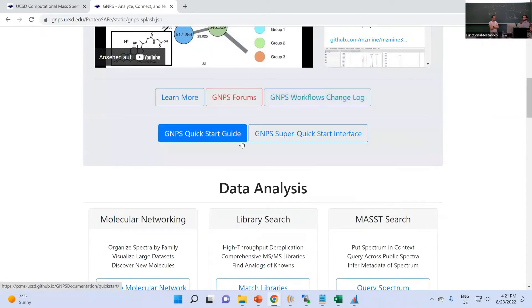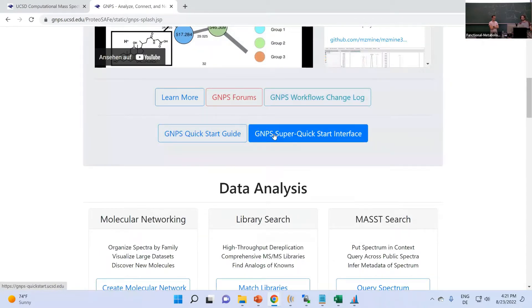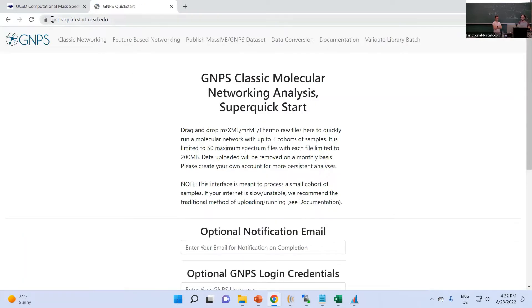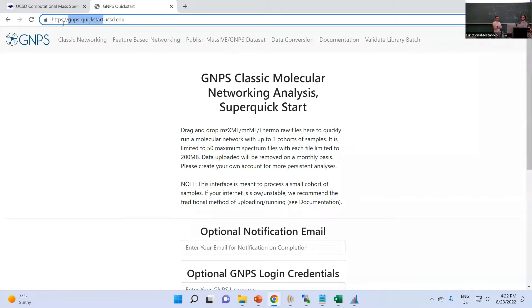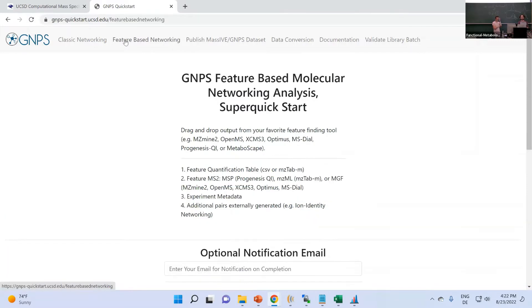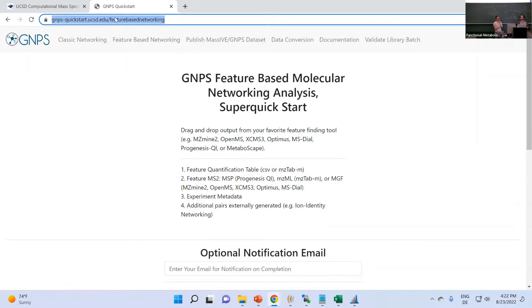I would like to start with the super quick start because I think it's actually the easiest way to get started. You just click on GNPS super quick start interface, not the guide interface. If you don't find it, it's also just gnps-quickstart.ucsd.edu. On the top row you can see there are multiple different quick starts — data conversion and other things that might be useful — but we go for feature-based networking and click on it, which should be a subdomain.